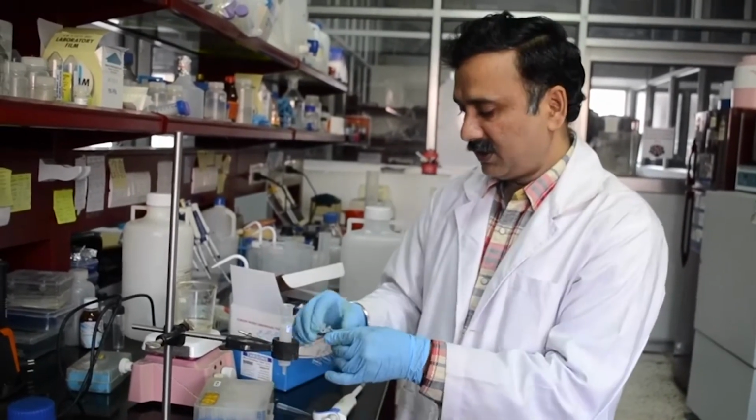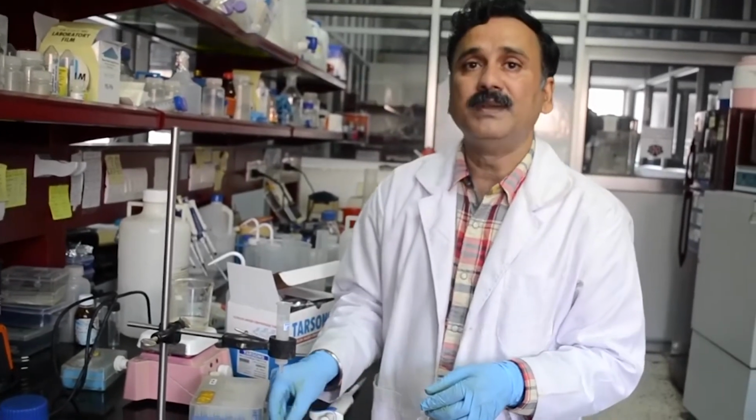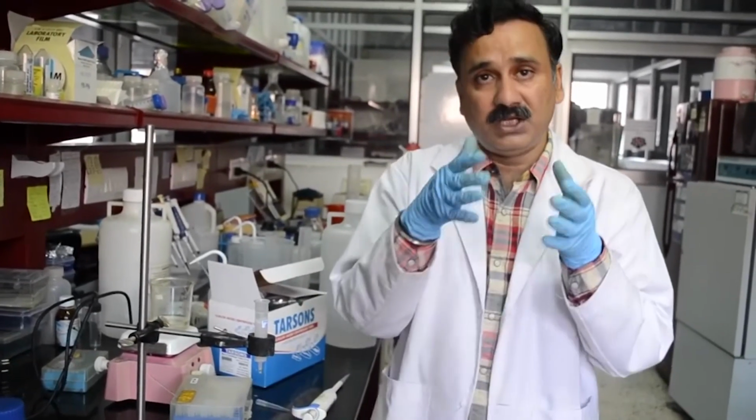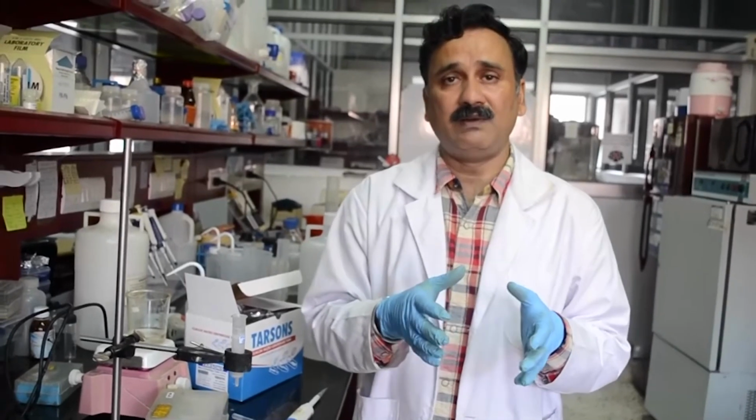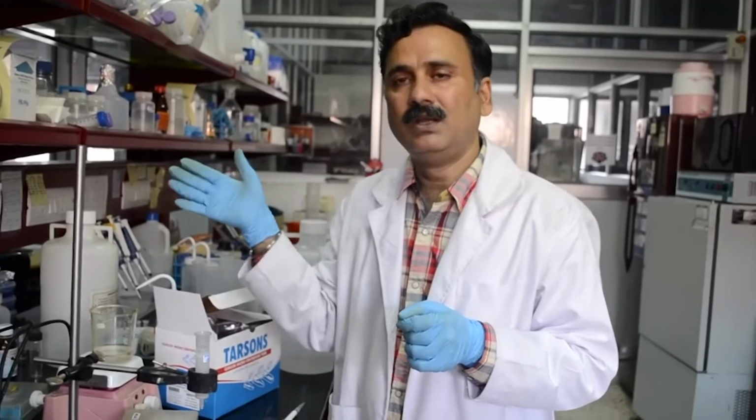If you collect these fractions and analyze them on SDS-PAGE, you will see that the initial 3 fractions have the protein of your interest, where fraction number 2 has the maximum amount of protein, and fractions 1 and 3 have a lower amount of protein. And from fractions 4, 5 and 6 you are going to get the salt.